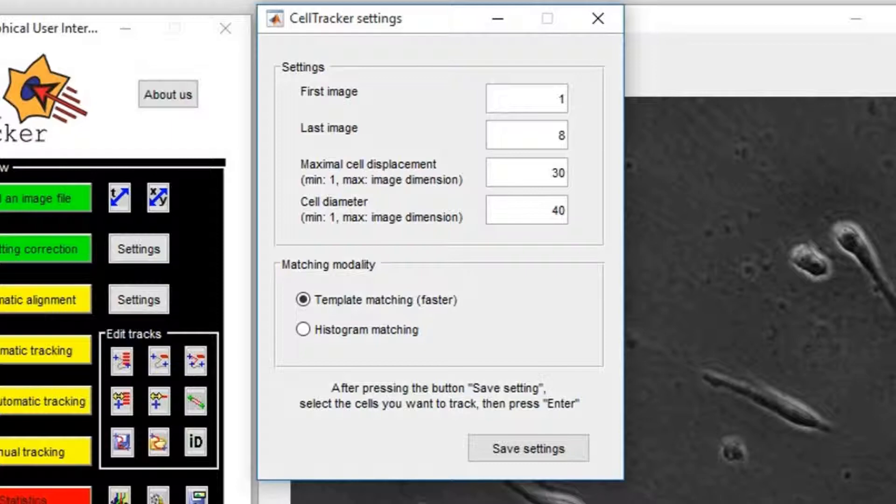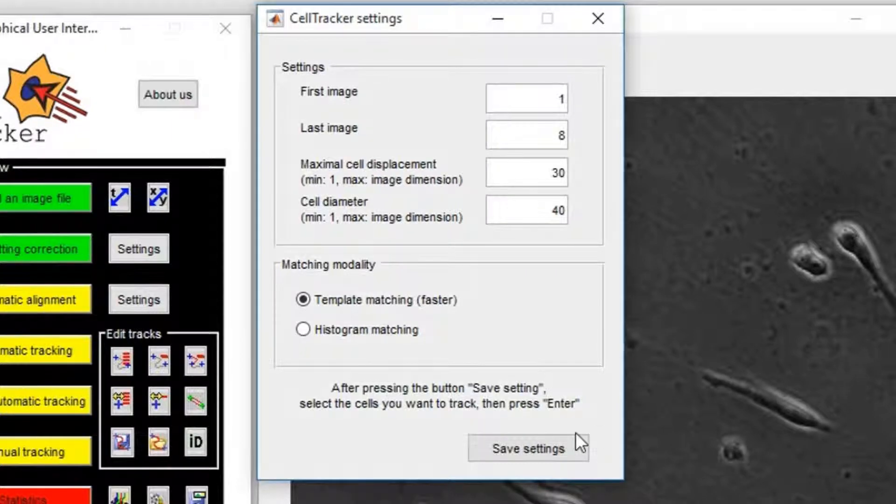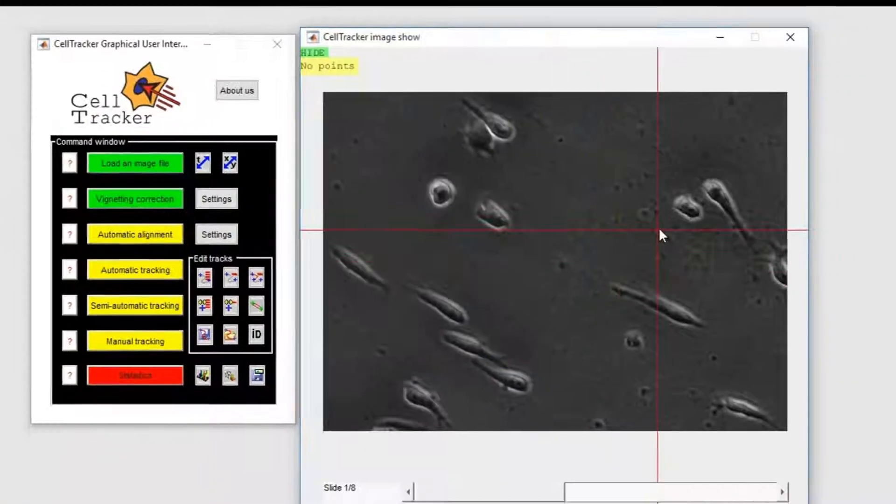In both of these modalities, the template is updated automatically at every fifth frame.